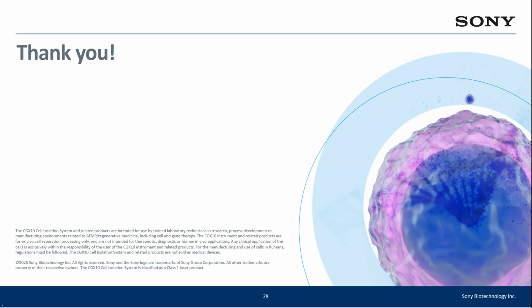The collection buffer can be supplemented with nutrients, with peptides, or with pluronic to enhance the flow. It can also be substituted with media with appropriate serum concentrations if you wish to collect your cells directly into media.